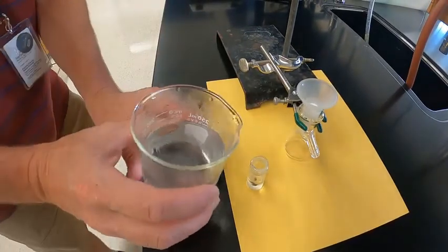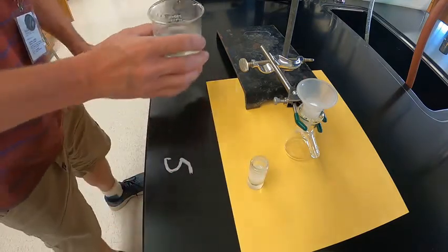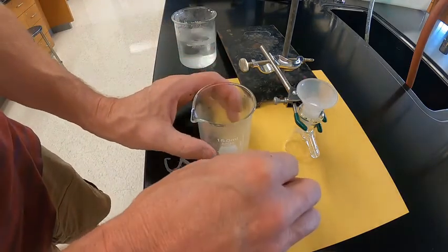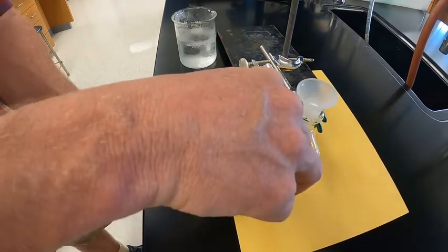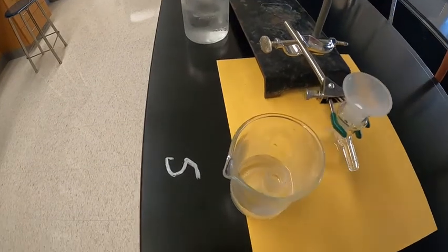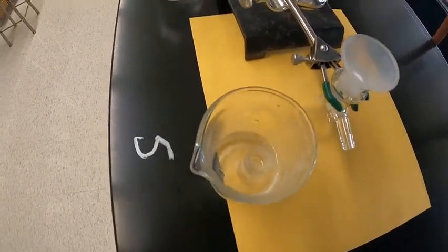So the point of adding the water is it's going to react with any excess acetic anhydride, and the water also makes the product more insoluble, whereas the reactants are more soluble in water. So now the goal is to cause all the product to precipitate out in a cold water bath.